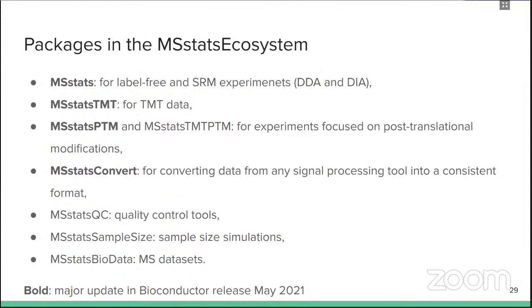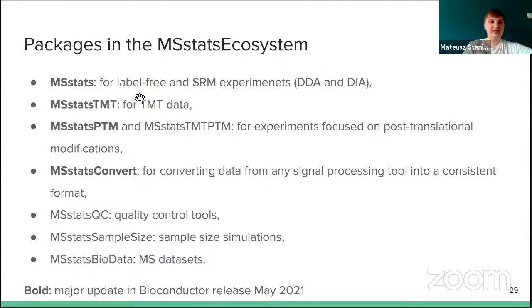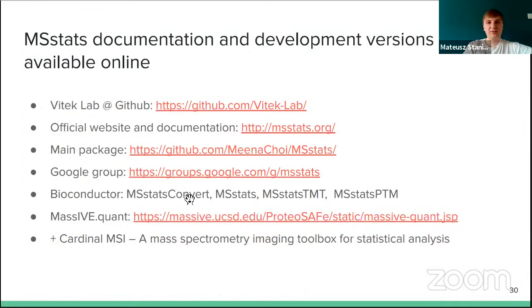Okay, so one more thing, so there are more packages in the MSstats ecosystem, but with the next release, the major updates will cover these four main packages. So MSstats, MSstatsTMT, PTM, and MSstatsConvert. And here's where you can find more information or help.